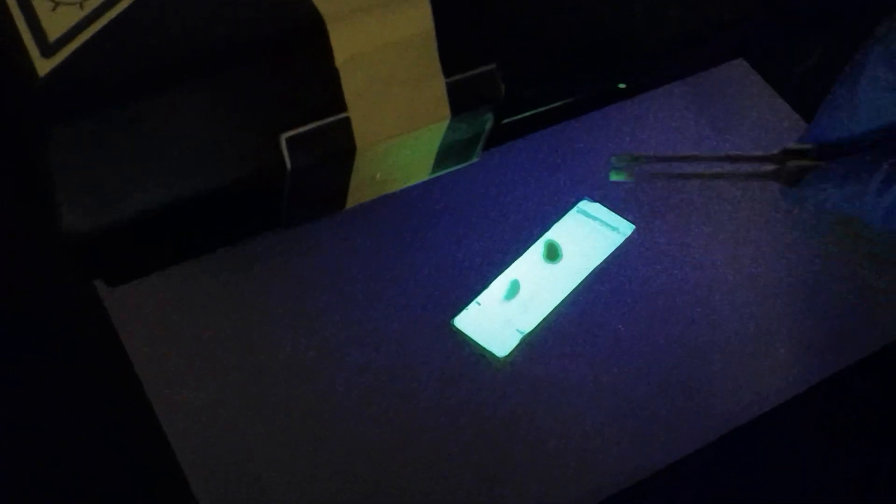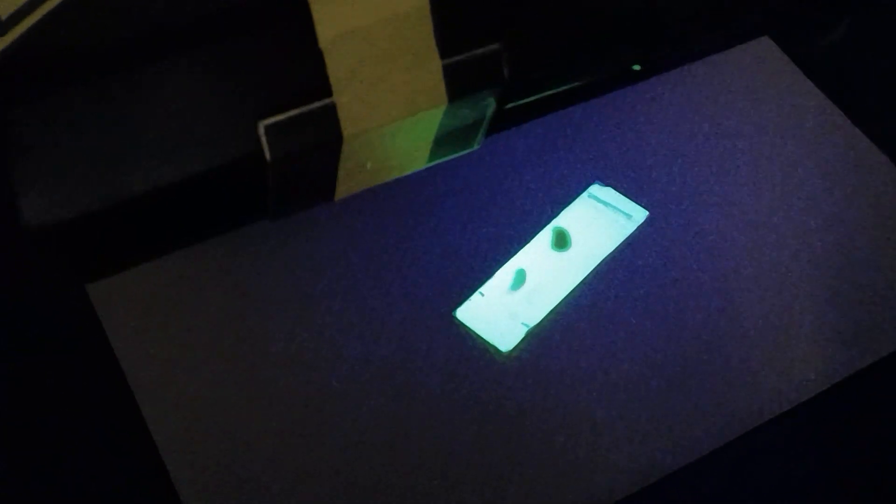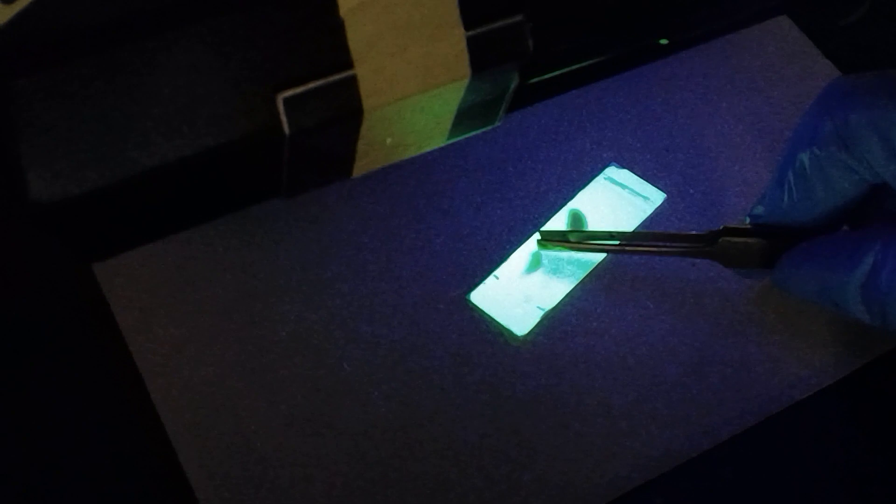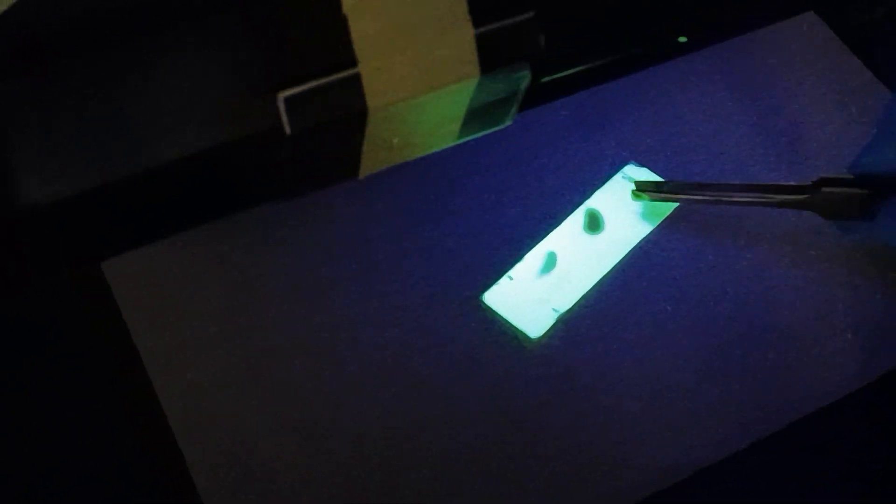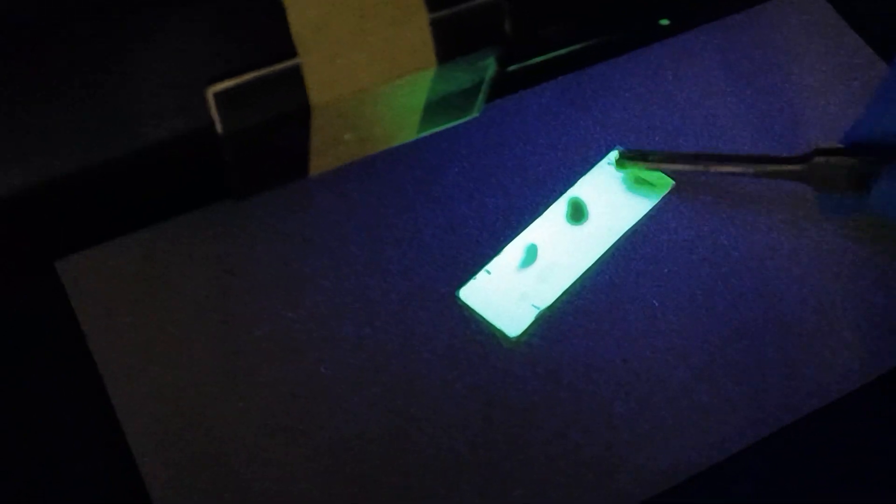If we can show you a little closer here on the left-hand side, I have the spots of the standard. So down below we would see our benzhydrol and up above benzophenone because benzophenone is less polar so it moved up.